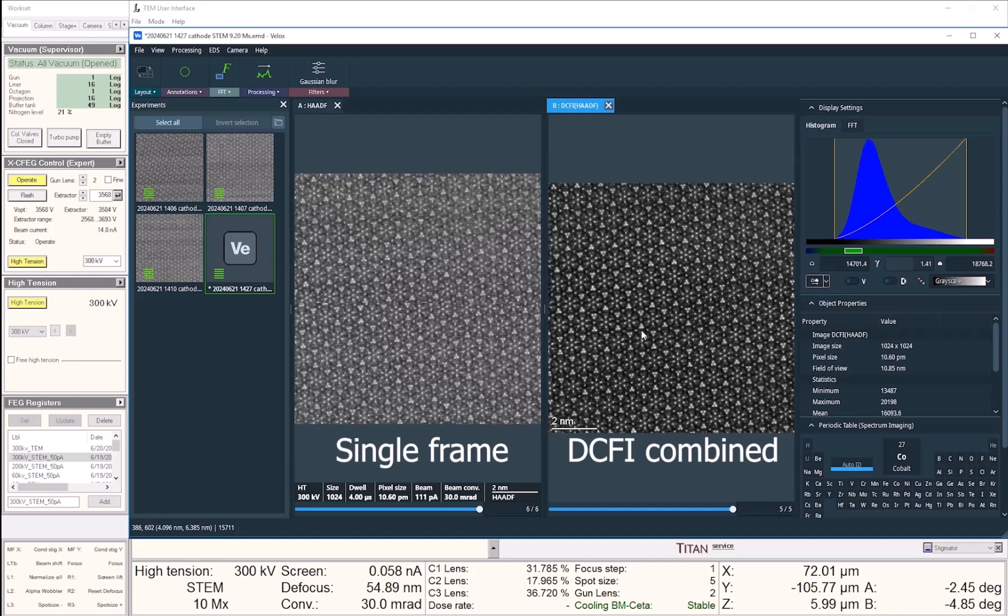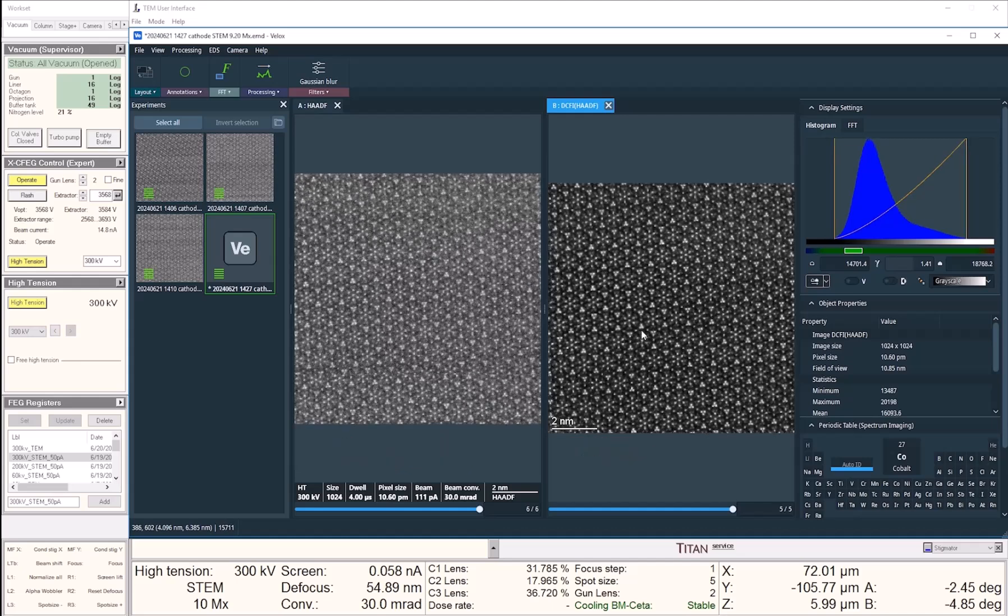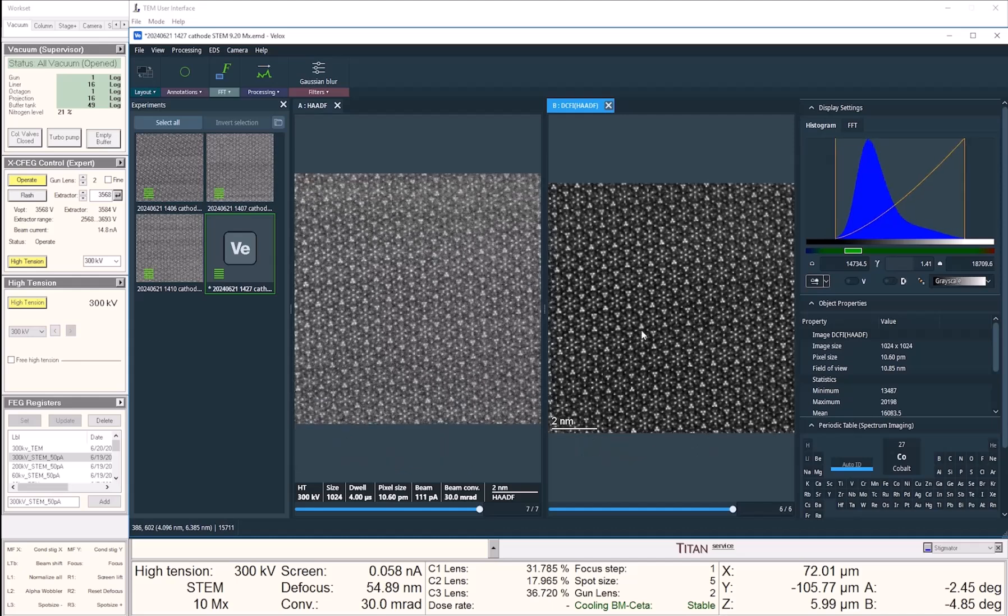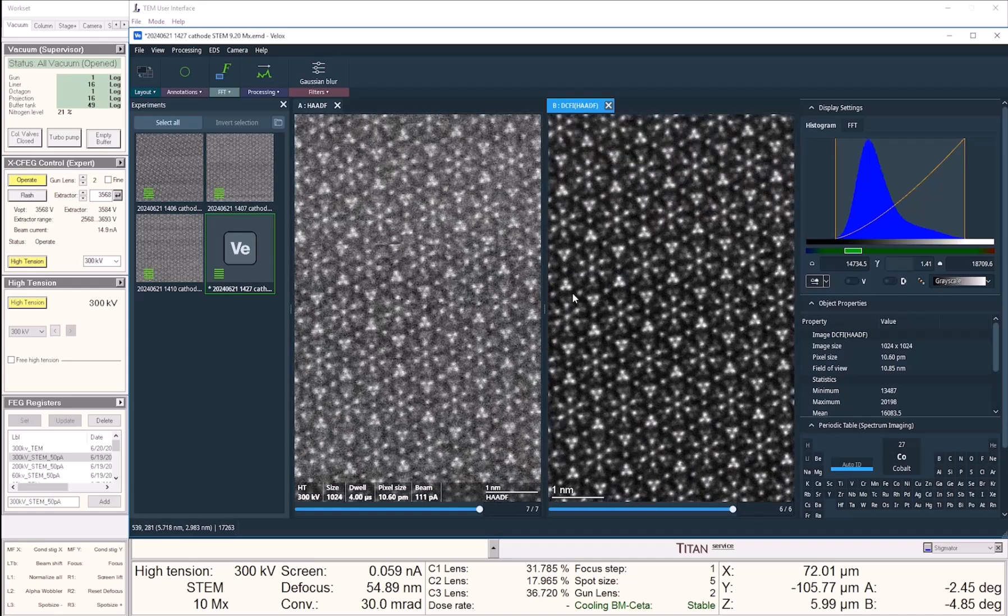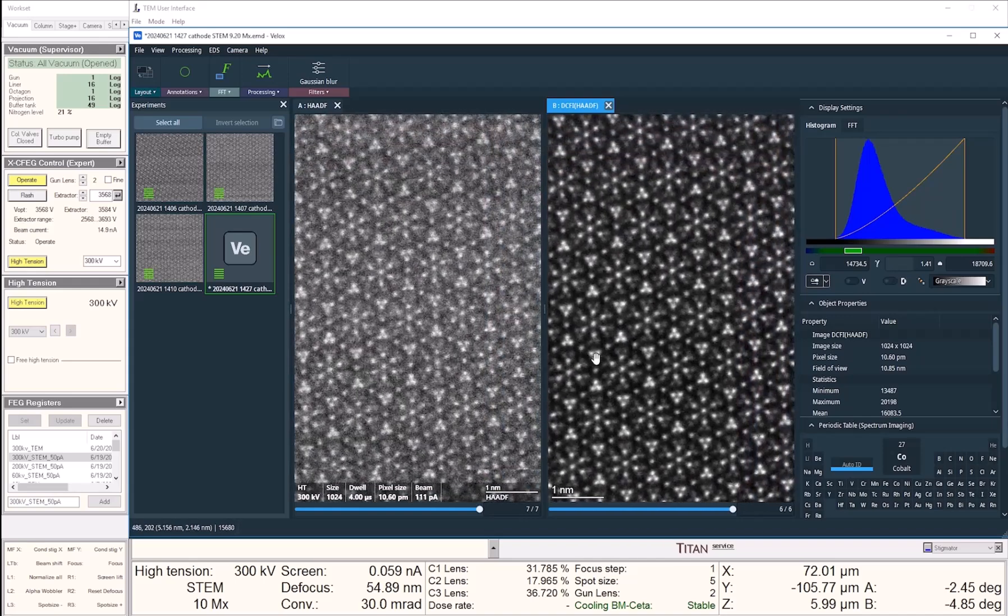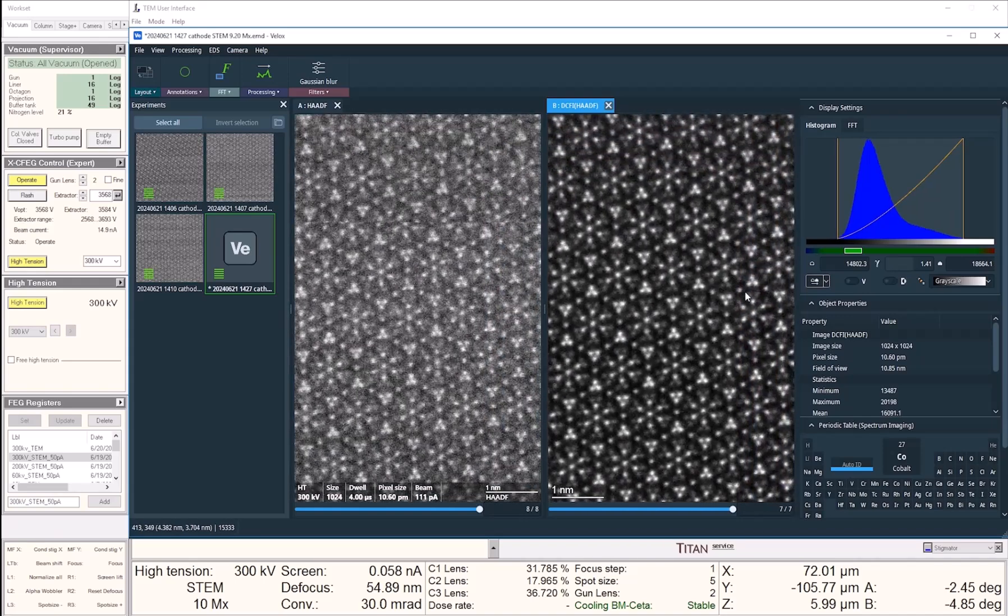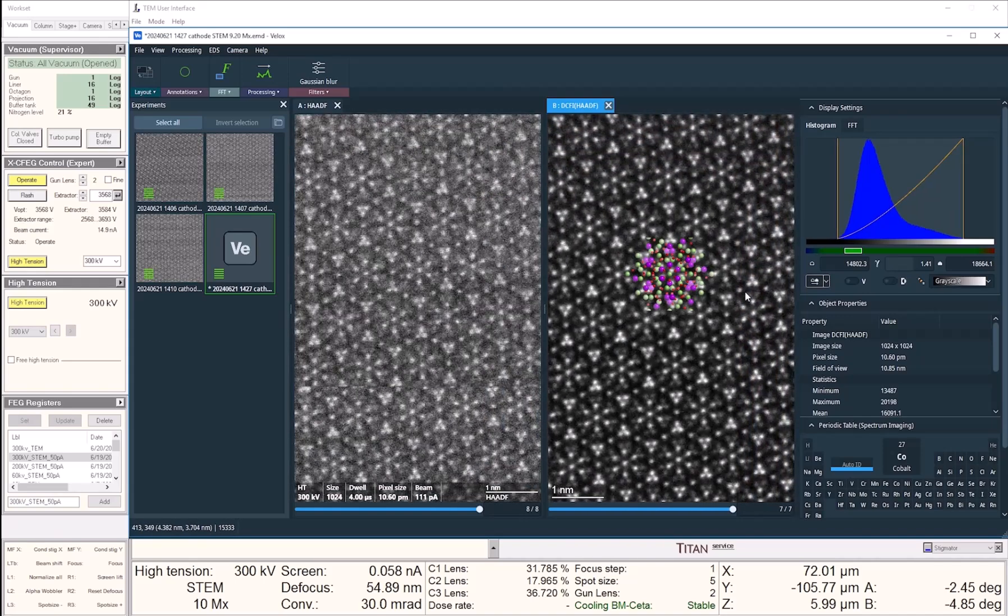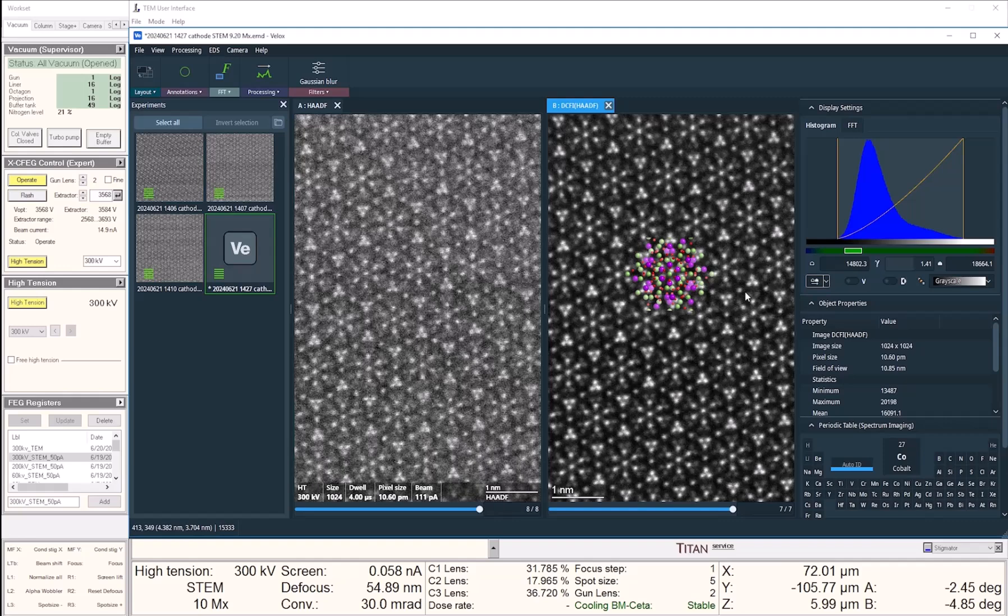We are now taking 10 frames, and each frame is a 1K by 1K image with 4 microseconds of dwell time. At the end, we have a very nice image of the sample.